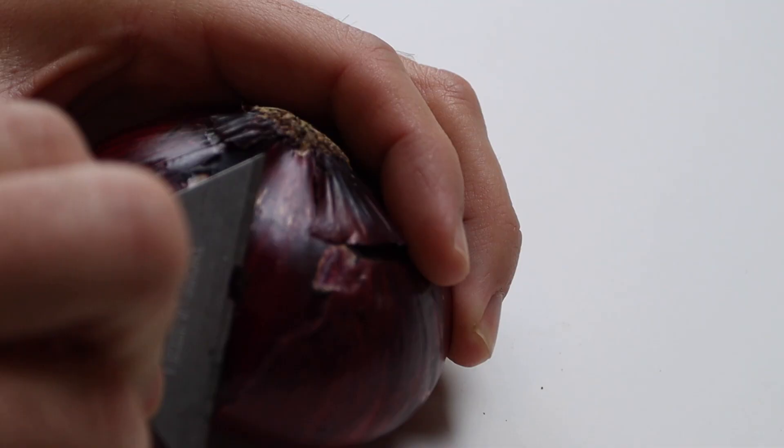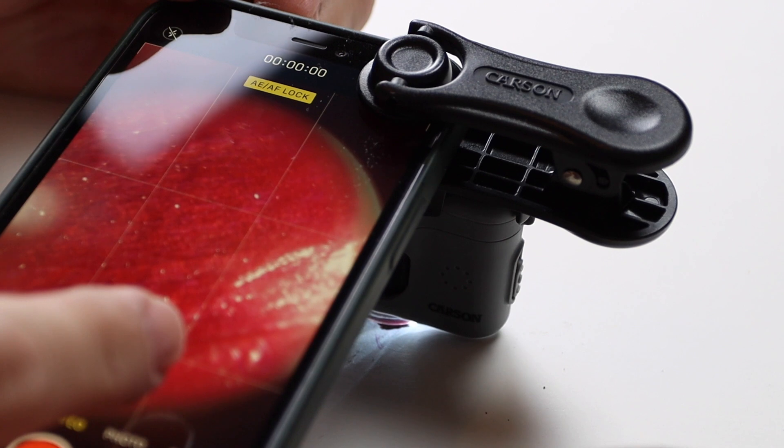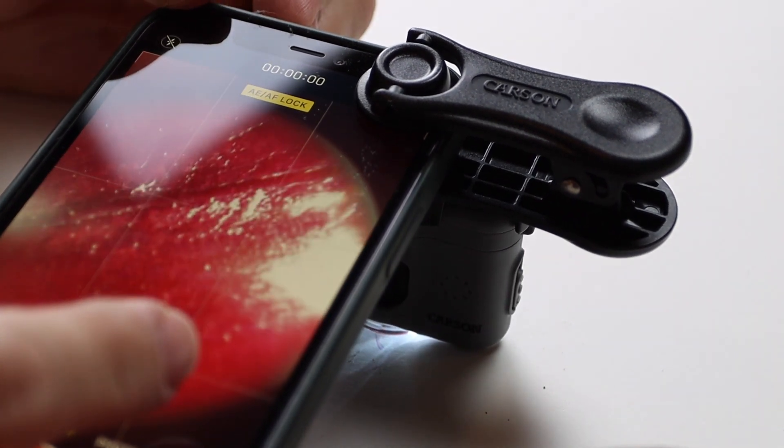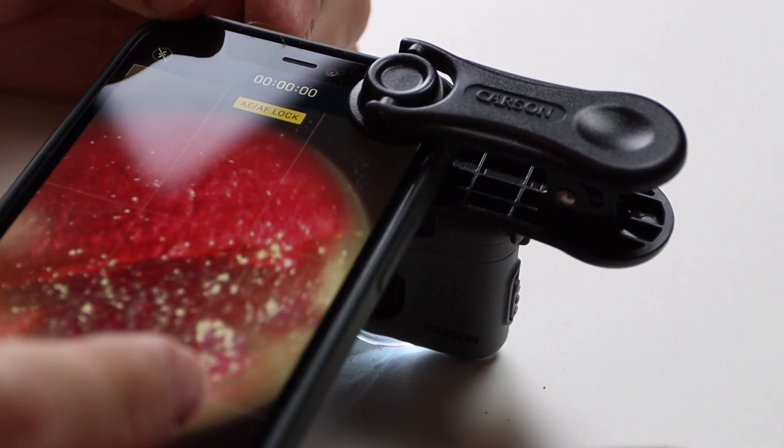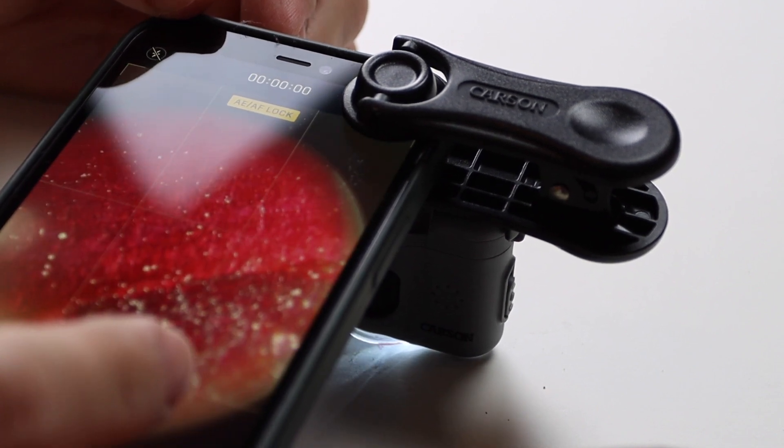We took an onion and a razor blade and shaved off a tiny fleck of the surface of the onion. Then you just attach the microscope to your cell phone and see what you can see. It's pretty simple — put the object under your lens, slowly approach it with the microscope, and you can start to get pretty clear images. After playing with the focus and with a little bit of practice, you are actually able to visualize individual plant cells on the onion skin.